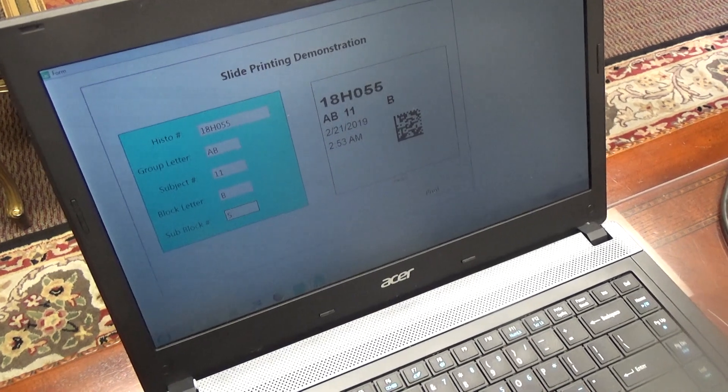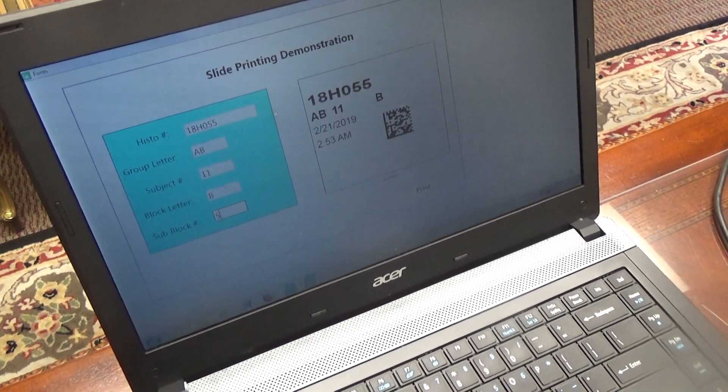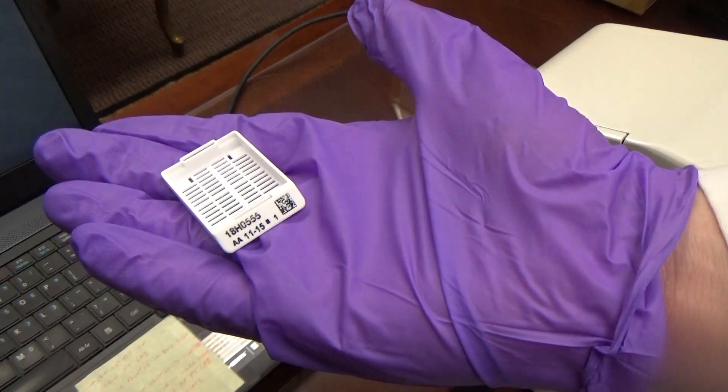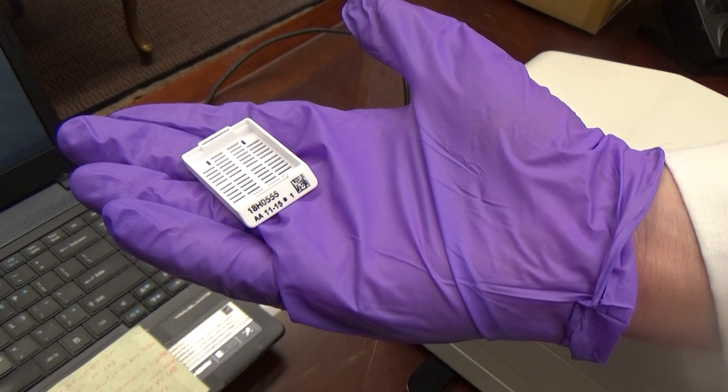We can develop custom software to your specifications. As shown, it's a sample that we have done in the past. Manual use of a slide printer is also available for labs that do not choose to have custom software developed.